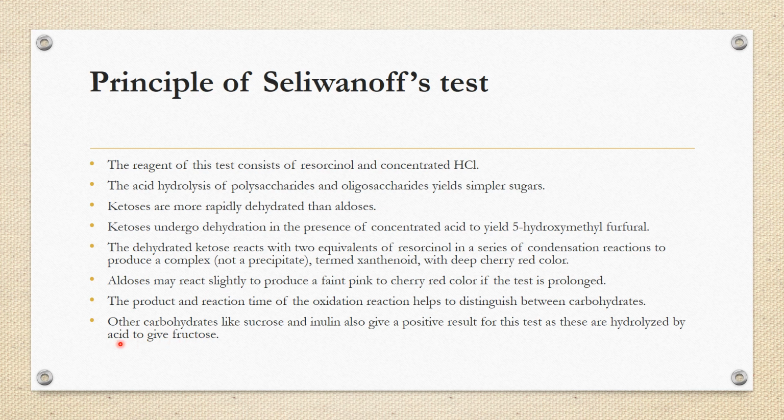Because it's a concentrated acid, it can hydrolyze inulin and sucrose also to give fructose, and fructose is a ketose. So sucrose and inulin can give a positive result also.